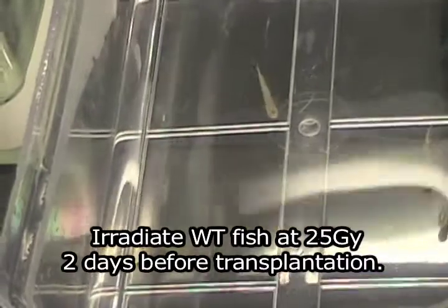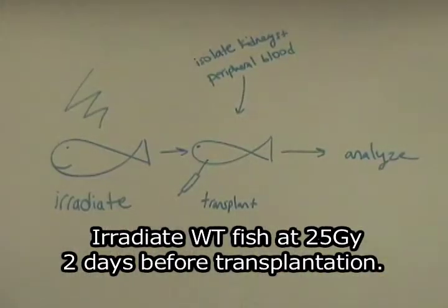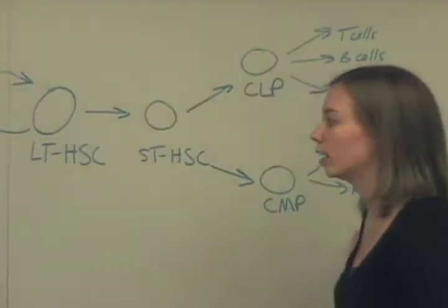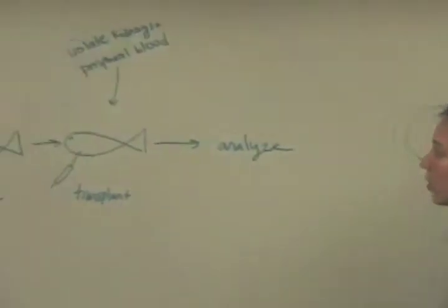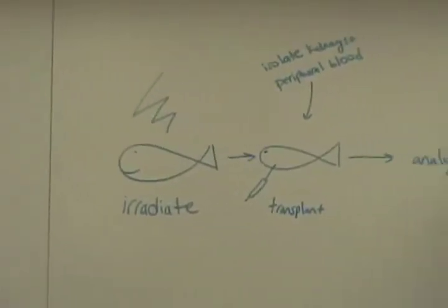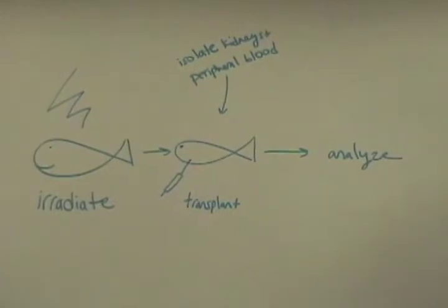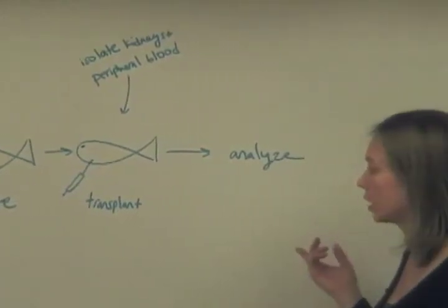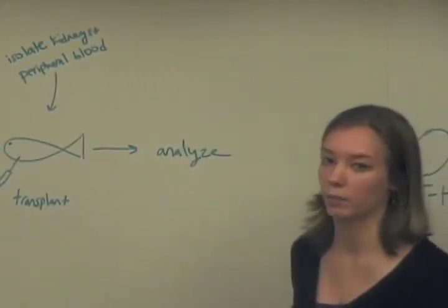Irradiate wild-type fish at 25 gray two days before transplantation. Then we have a clean system, and we can transplant in donor marrow from fluorescent transgenic donors. This way we can watch the cells that we transplant in and see if they can repopulate the blood.